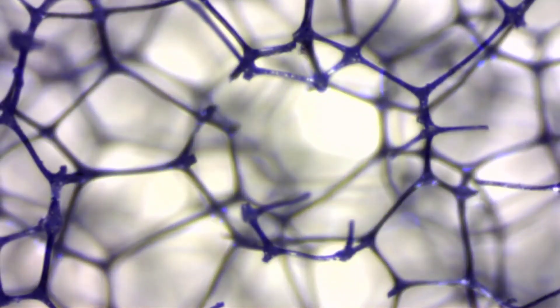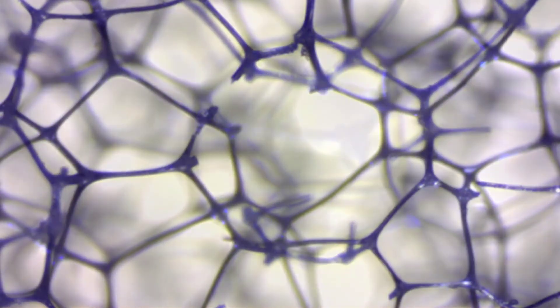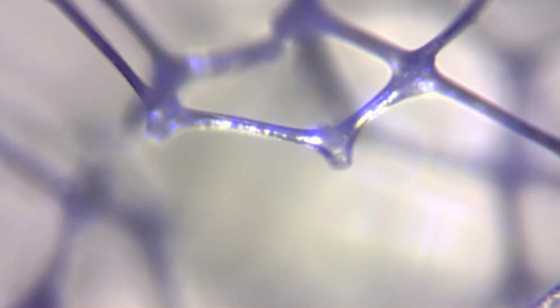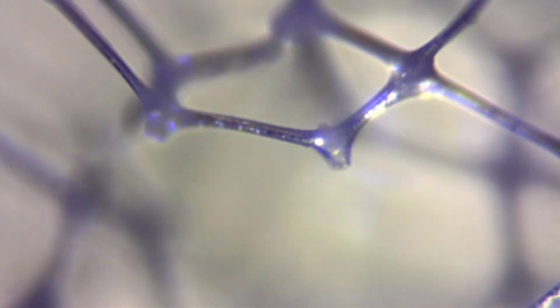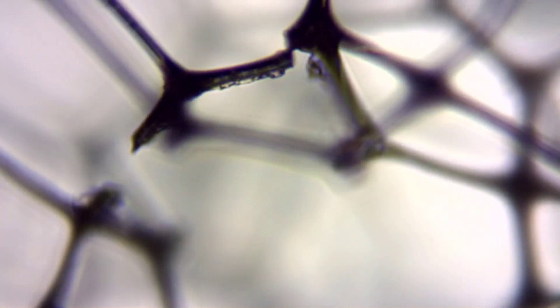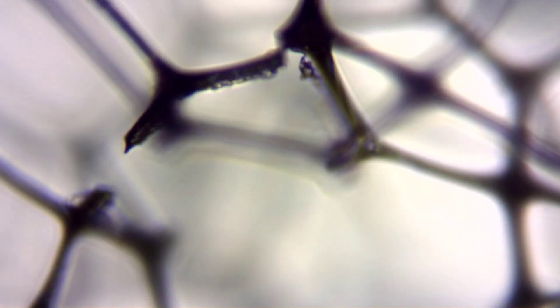So when you're using it, it's basically acting as sandpaper. These little broken sharp corners is what's scraping away all the dirt and grime. If you've used these before, you'll notice that if you don't wear gloves your hands get white because of these little microscopic broken pieces.